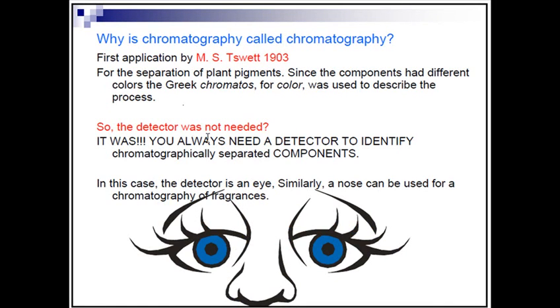So what is actually the chromatogram? The first application was done by M. S. Tswett, in 1903.